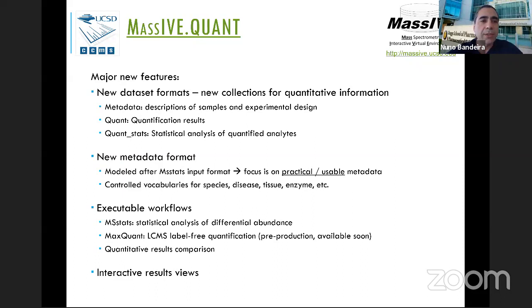So there's now a way to add metadata to a dataset where you actually can describe the samples and the experimental design for the dataset. There's a way to submit quantification results in formats that are reusable, and there's a collection of formats that are supported. And there's a way to support the results of the statistical analysis of quantified analytes. There's a collection specifically for that.